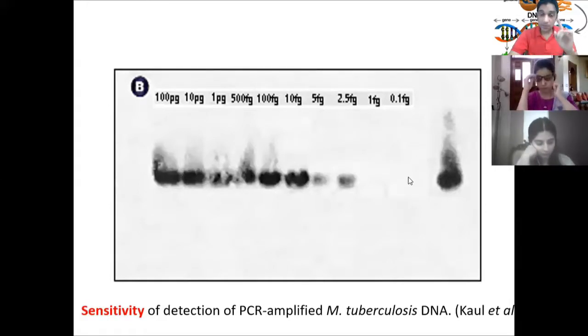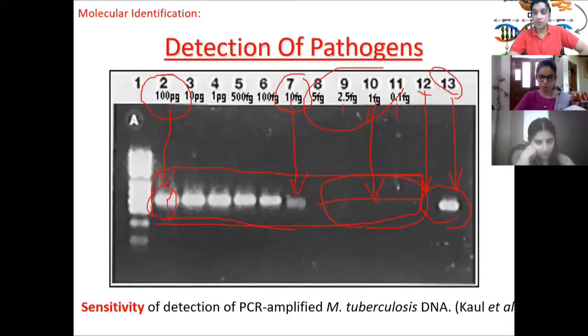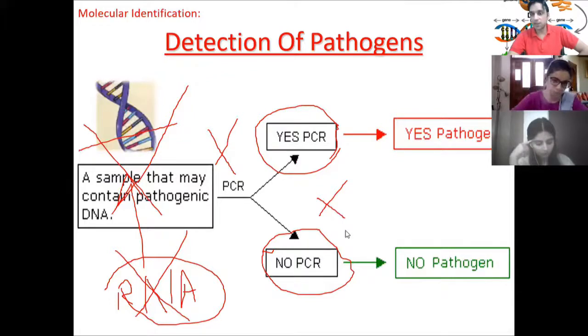The reason why the people are not getting accurate results depends on lots of factors. If you can go back to my slide, this one, हसन अगर आप देख रहे हैं तो I shared here that this is the first step. You need to be perfect here. Second step, you need to be perfect here. Third step, you need to be perfect here. And then the fourth, if any of those steps is not executed in a professional way, you will get the results wrong. And since this is like a new virus, so we are dealing with lots of false results from the labs as well. अभी वो भी उन्होंने भी काम सीखा नहीं है.